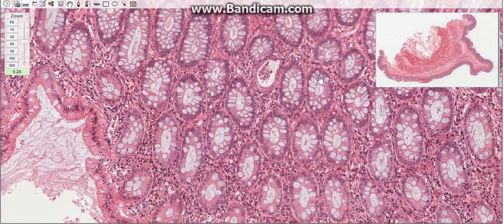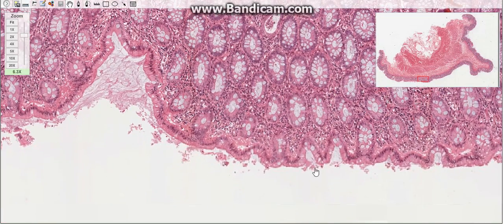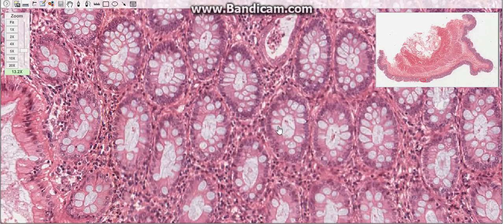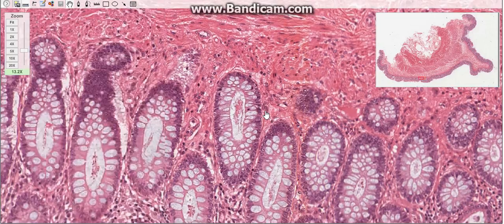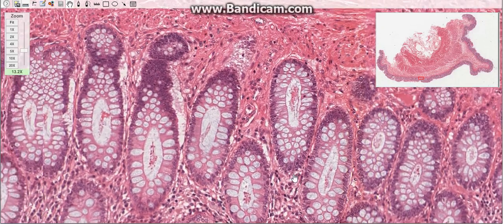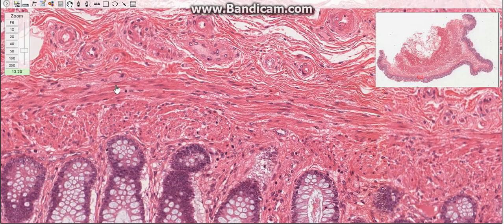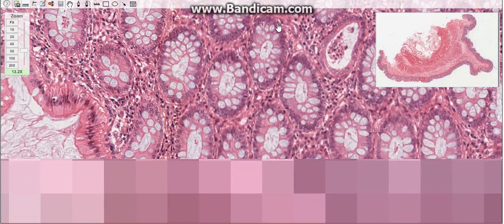The first layer, the mucosa, consists of epithelium, lamina propria, and muscularis mucosa. The epithelium is simple columnar, and the lamina propria is composed of loose connective tissue, rich in lymphoid cells and lymphoid nodules. The extensive development of GALT — gut-associated lymphoid tissue — reflects the abundance and variety of microorganisms and noxious end products of metabolism. The muscularis mucosa consists of smooth muscle tissue with circular and longitudinal layers.